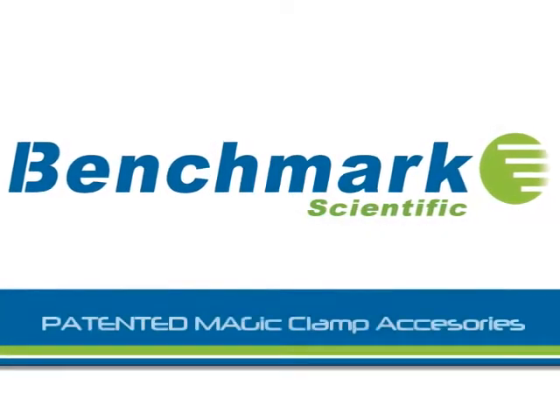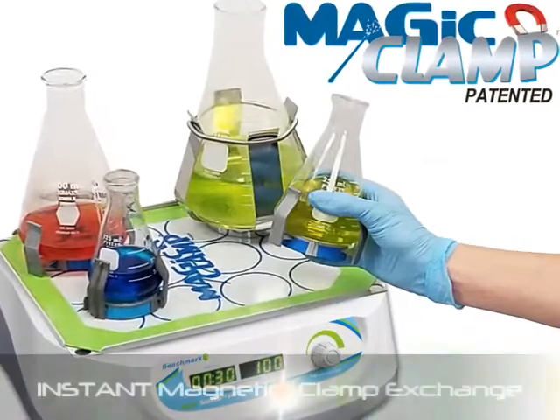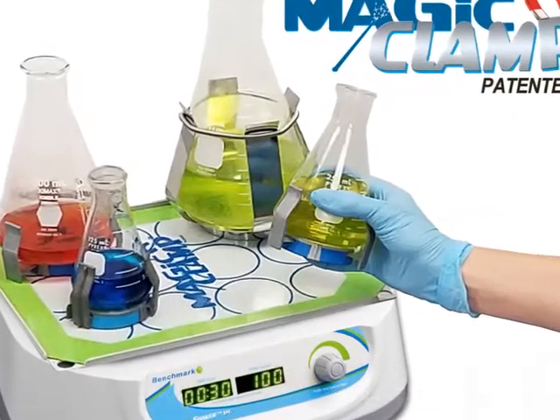Benchmark Scientific presents Magic Clamp, our patented magnetic attachment system for securing flasks and other common laboratory vessels to a laboratory shaker.